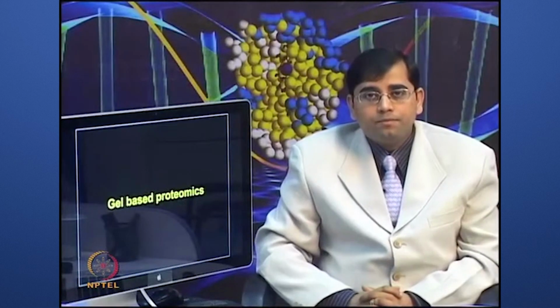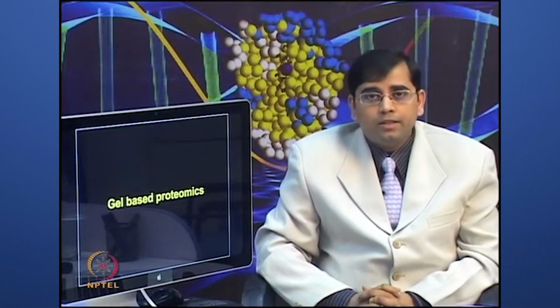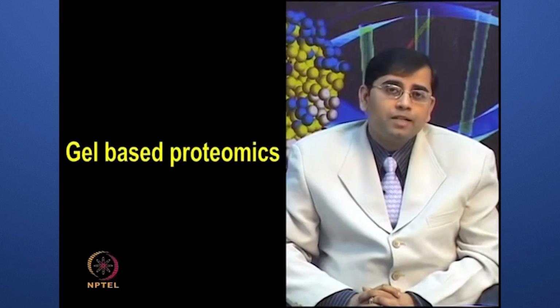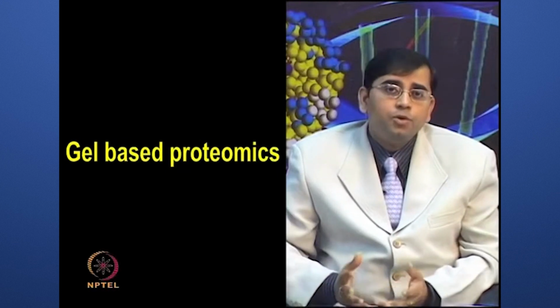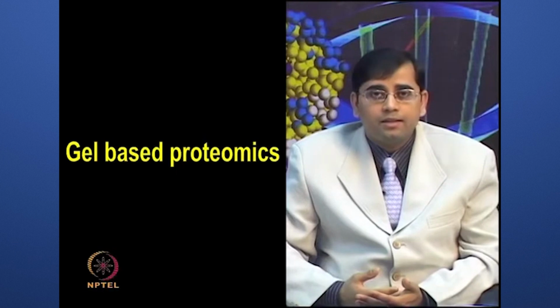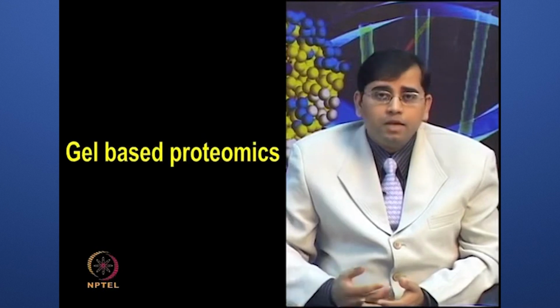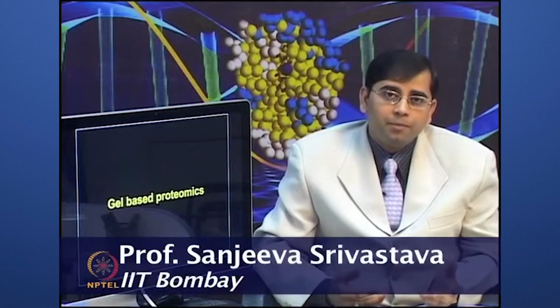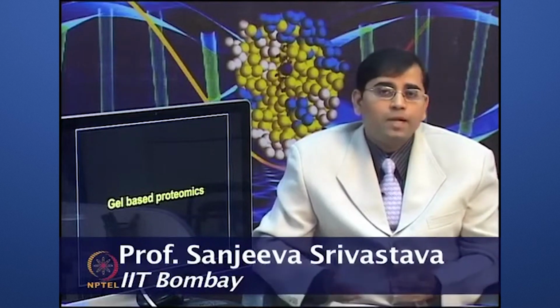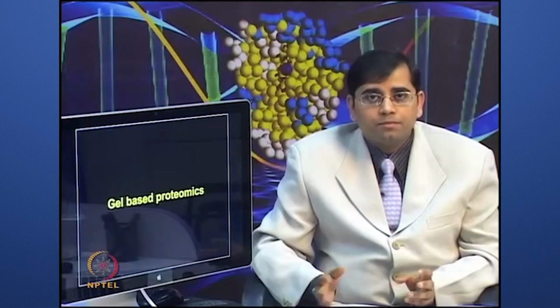So, we will continue our discussion on proteomics, and now since you have prepared a good sample, it can be applied either on gel based proteomics approaches such as two-dimensional electrophoresis, or it can be used for gel free proteomic approaches such as mass spectrometry. So, we will continue our lecture on gel based proteomics and then demonstrate how you can use your prepared sample further for analysis of complex proteomes such as serum proteome, bacterial proteome and plant proteome. Thank you.